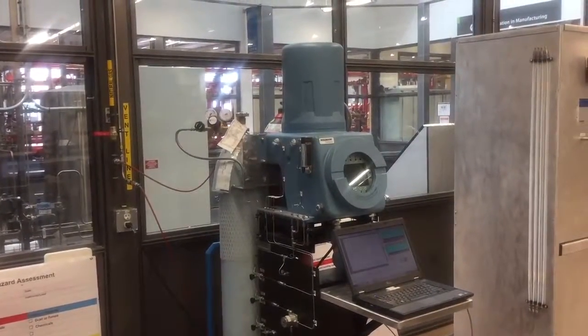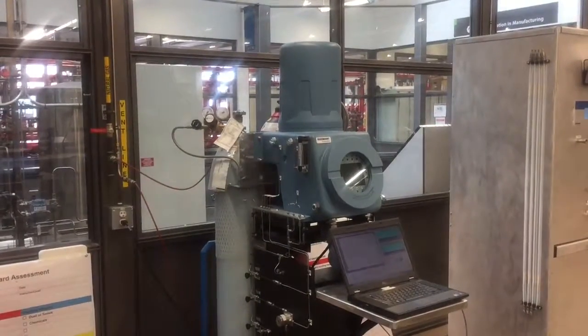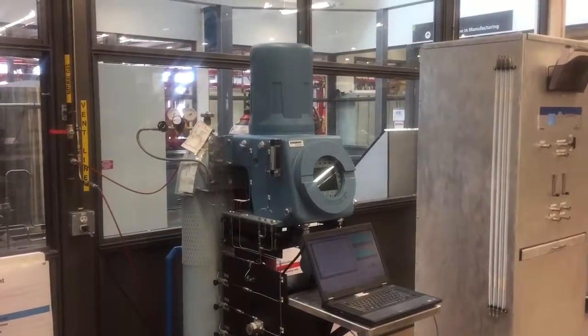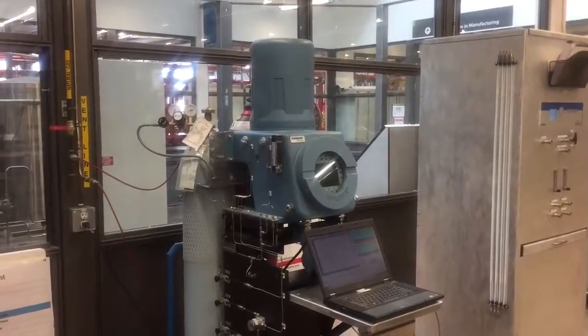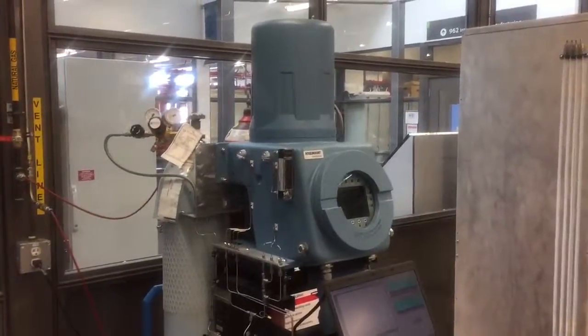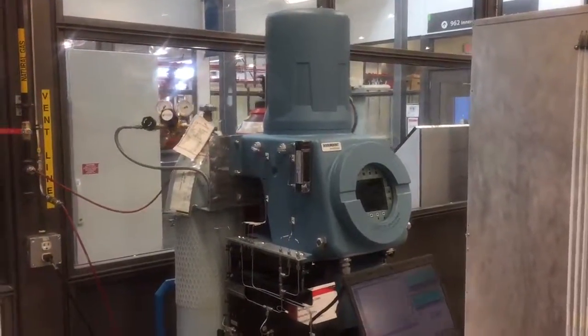This is the pre-lab video for our process chromatography lab here at Red Deer College. In front of us we have a Rosemount 700XA gas chromatograph. I'm going to do a quick demonstration of the components that we have here for this analyzer.